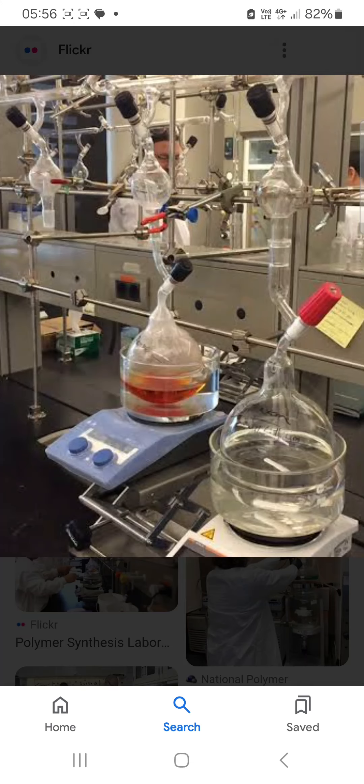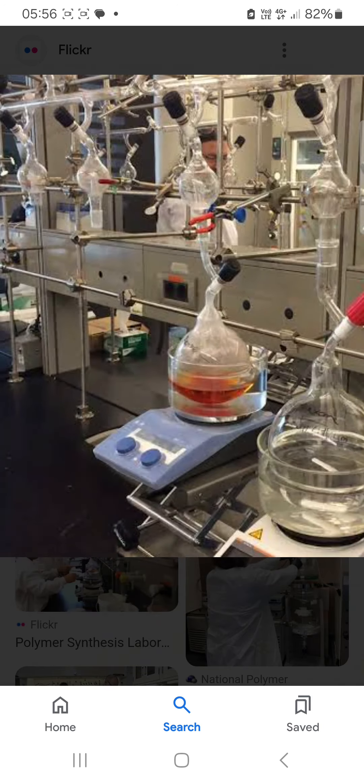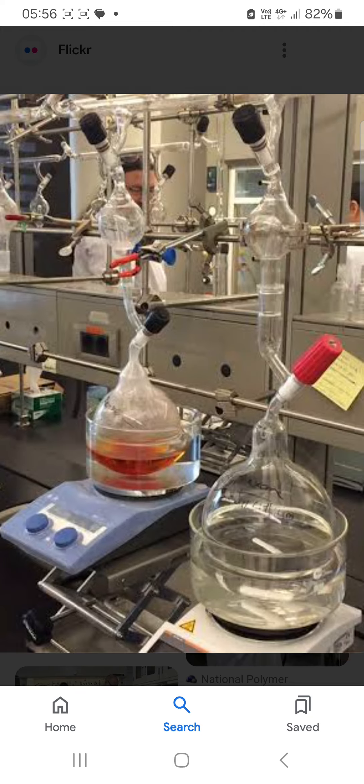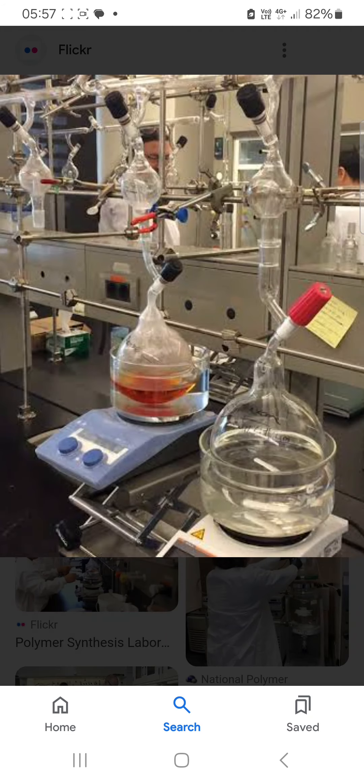Hello friend, this is the setup for polymer synthesis. You can see the Schlenk line — this glass from here to here is known as the Schlenk line. You can see here the special glass which is set on the water bath, and this is the magnetic stirrer jack. Here you see the connections. So this is the equipment or setup for the synthesis of polymer.